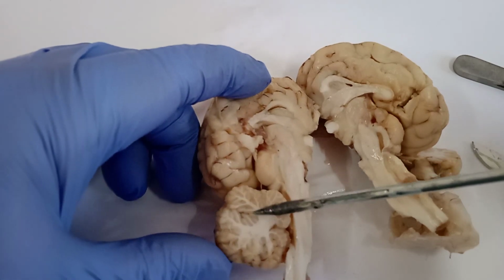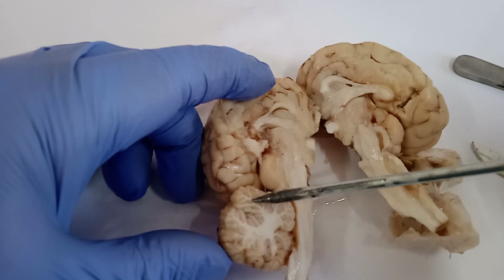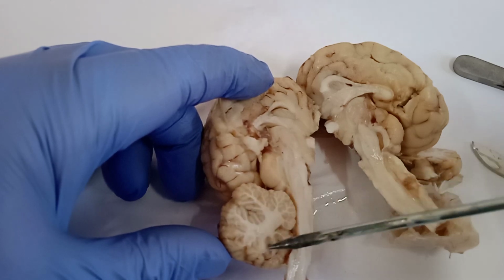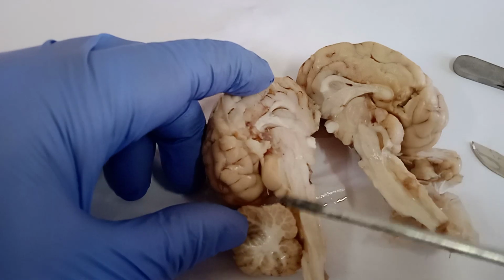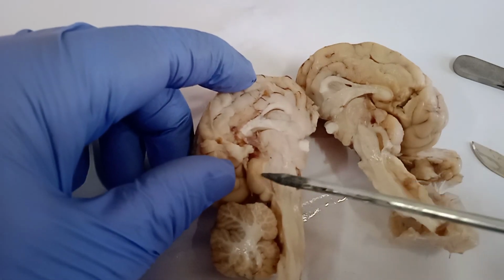This is the cerebellum. You see the arrangement of the white matter in the cerebellum in the form of a tree, and this is called arbor vitae. So this is how the white matter is arranged in the form of a tree. This is also called the tree of life in this area. And this is how the gray matter is arranged in the cerebellum. So this is the inferior colliculi. That small fiber is the fourth nerve.